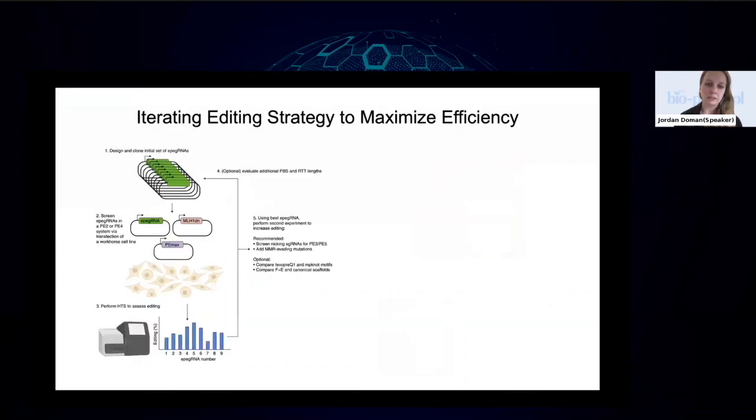So after that first pass experiment, you'll have these pegRNAs, each one will be transfected into its own well of a 96-well plate in this nice cell line that you've made. Maybe you're going to use MLH1DN because you don't want to optimize nicking guides. So you'll do a transfection, and then you'll perform HTS or whatever readout you're going to do 3 days later. And you'll see where you initially land with your editing efficiency. And this first pass outcome can be very different between different types of edits and different sites.